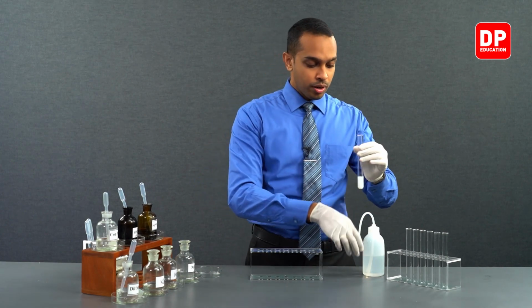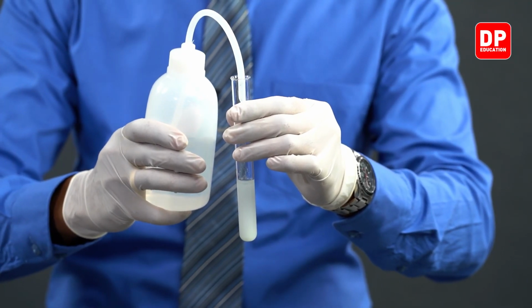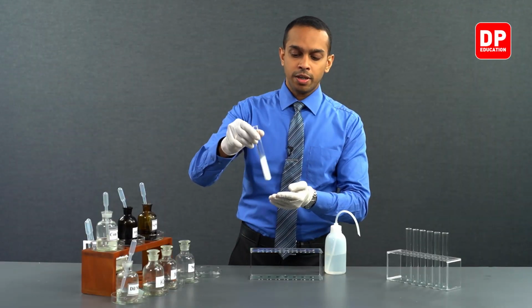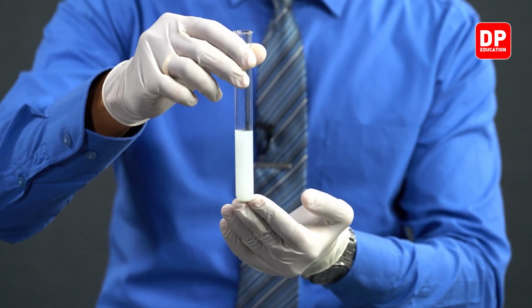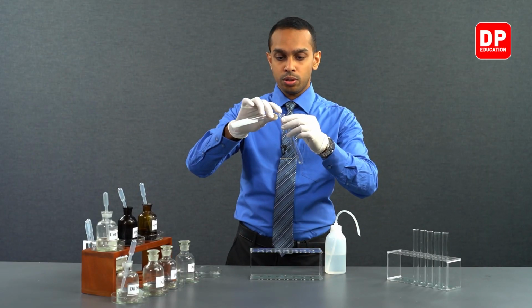Right, so we will dilute this suspension of silver bromide a little bit further. After diluting it a little bit, now this is silver bromide solid particle suspended in aqueous solution. We'll be separating it into two other test tubes.